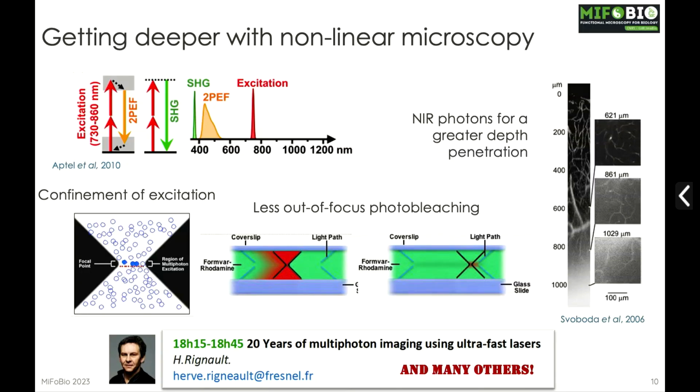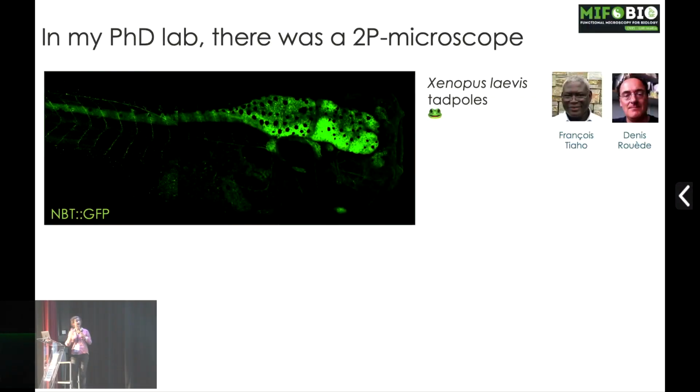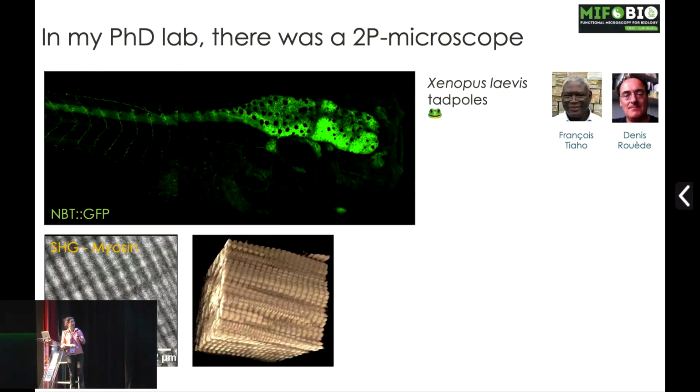And I said that I would tell you a bit of the story through the prism of my own experience as a baby MiFoBio, let's say. So I did my PhD in Rennes, and I was at first interested in the development of the nervous system of Xenopus laevis. We were imaging them because we were lucky enough to have a 2-photon microscope in the lab. That's pretty much all we had. I was recycling tubes and so on, but those samples and that microscope were enough to make me happy. And we were also investigating signal for free.